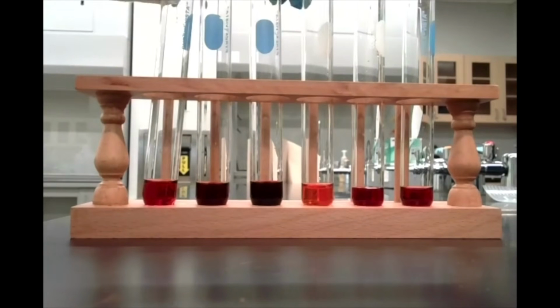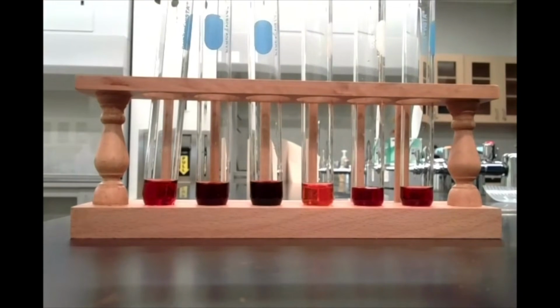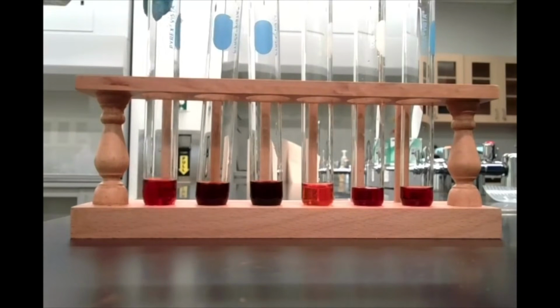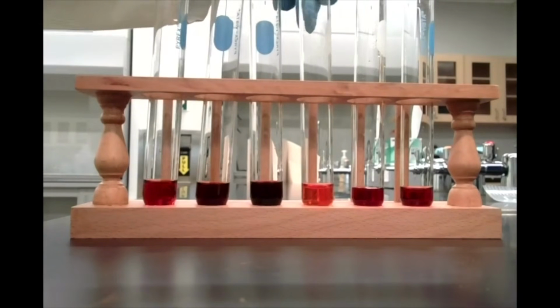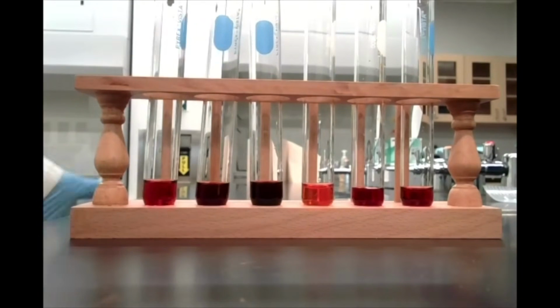Okay. And again, you should be able, hopefully, to see the difference between our test tube number 4 and our reference test tube number 1. There should be a pretty discernible difference between the two. Okay, so please make a note of that difference and account for it. Why did we see the difference that we do? Which way has this equilibrium shifted?